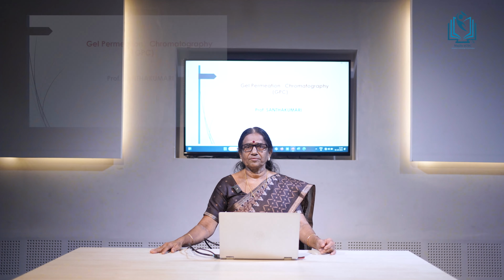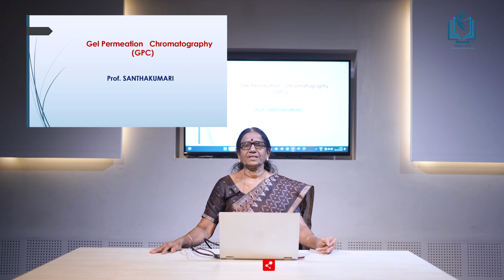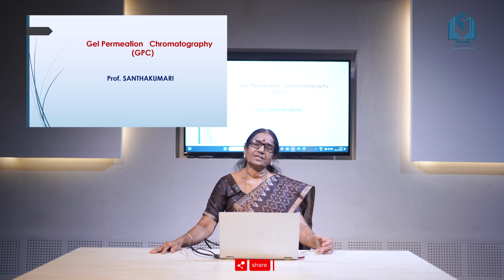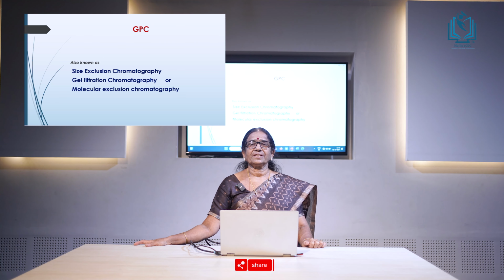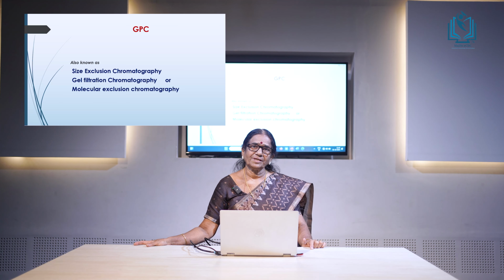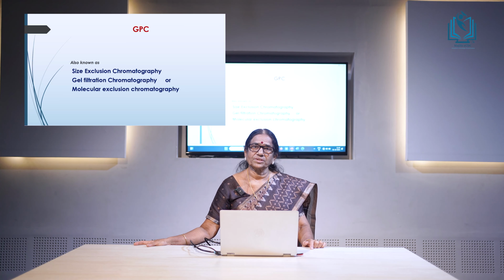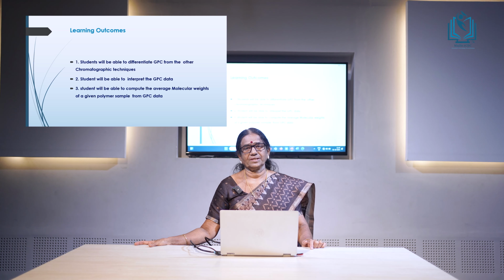Today I would like to discuss gel permeation chromatography or GPC, and this chromatographic technique is somewhat different from the other chromatographic techniques. This chromatographic technique, that is GPC, is also known as size exclusion chromatography, gel filtration chromatography and molecular exclusion chromatography.